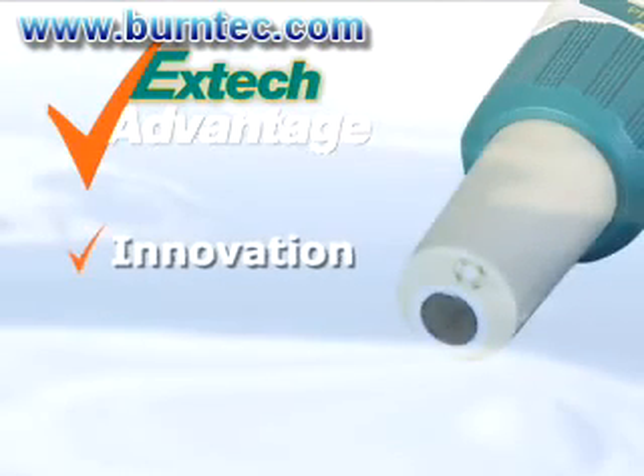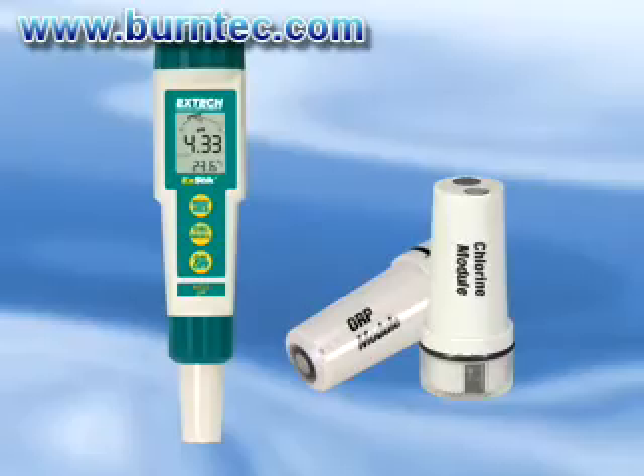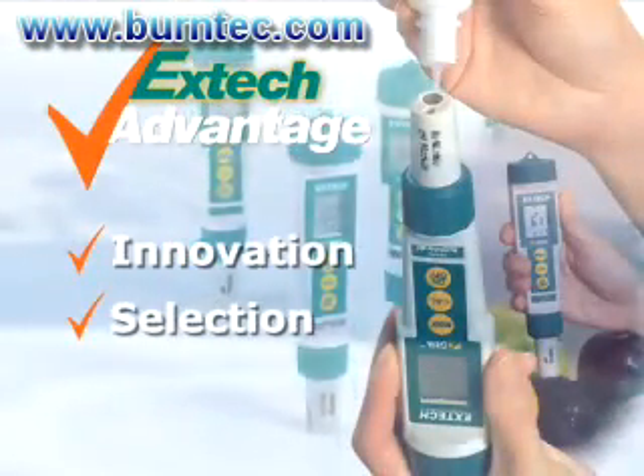Extech stresses on innovation to help you solve your day-to-day problems by using the latest technology. The Extech pH meters are designed to also measure chlorine and ORP by changing the electrode module. We offer you a selection of meters and accessories to meet your application needs.